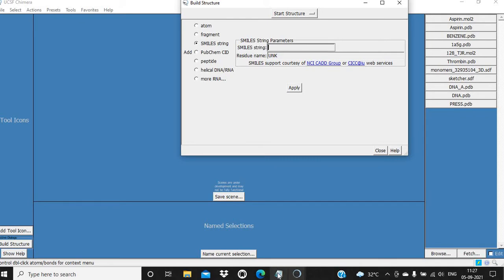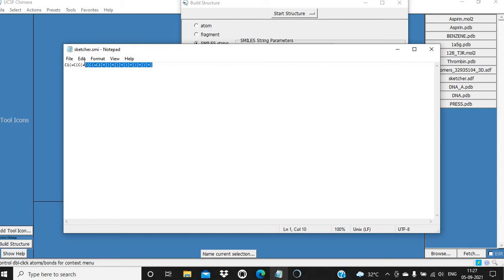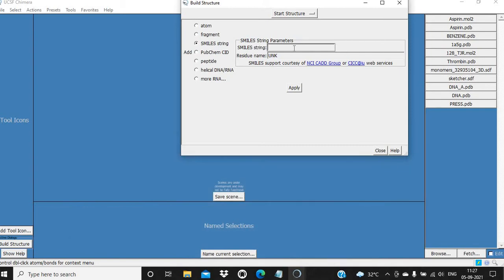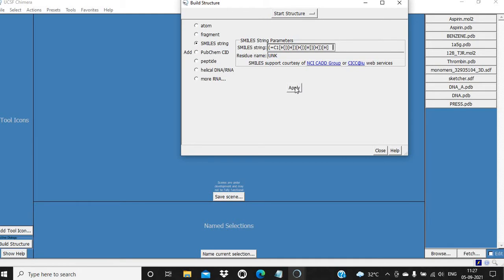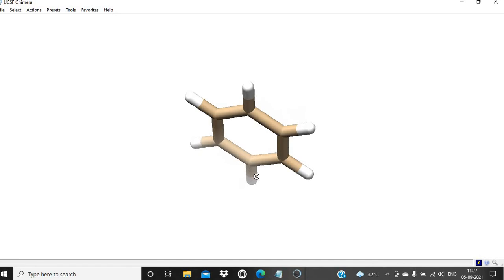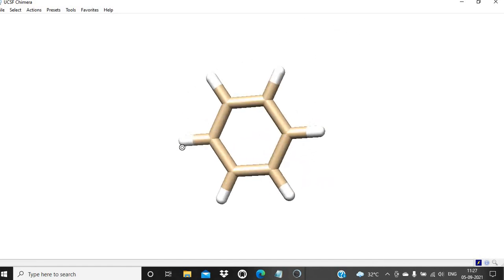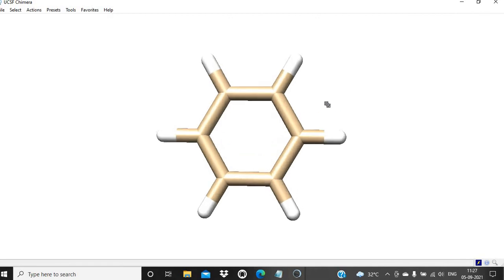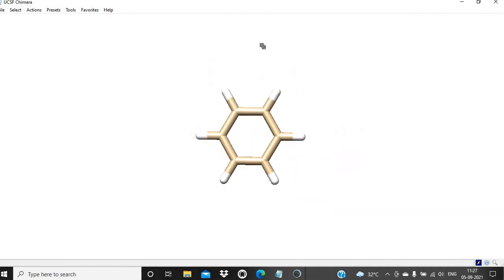We have to first copy the SMILES notation, and then Ctrl+V will paste the SMILES notation of benzene into this area. Then simply click on Apply. After that you will get the benzene structure in 3D. You can rotate it, you can also translate it, you can zoom in and zoom out.